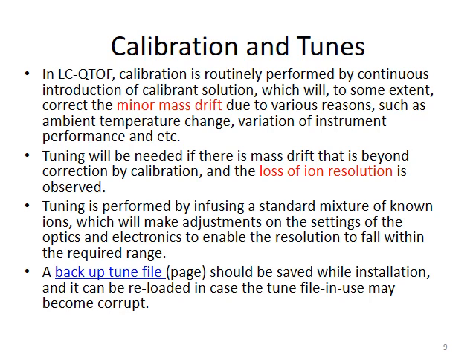In contrast, tuning can correct some mass drift which cannot be corrected by your calibration. And not only that, tuning can also correct resolution loss. So this is the difference between calibration and tuning. And it does change some settings to achieve the preset mass accuracy and resolution requirement.